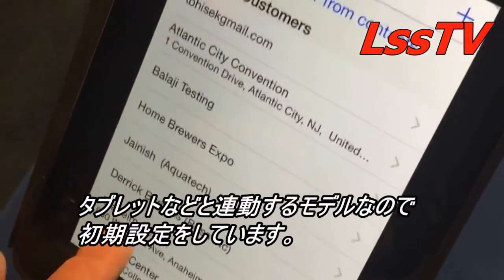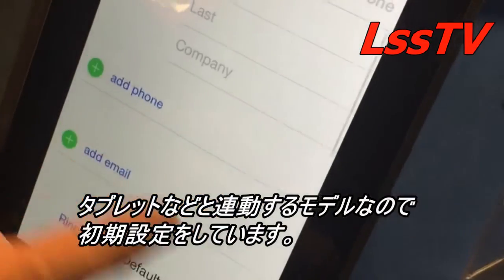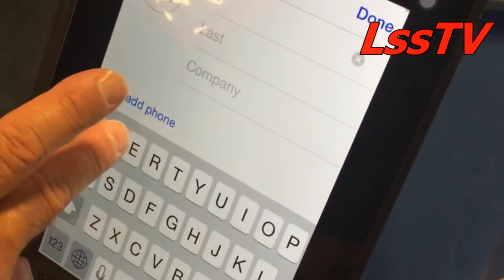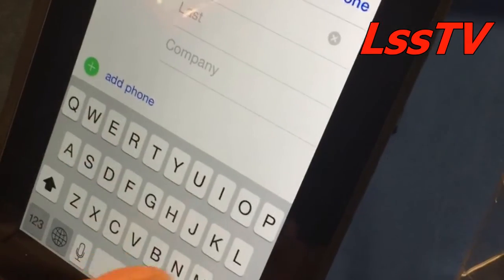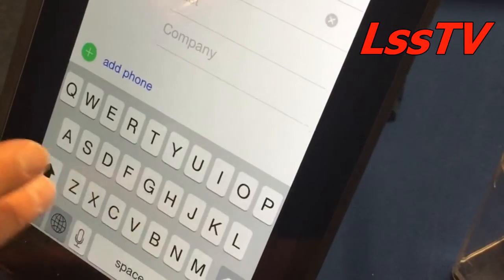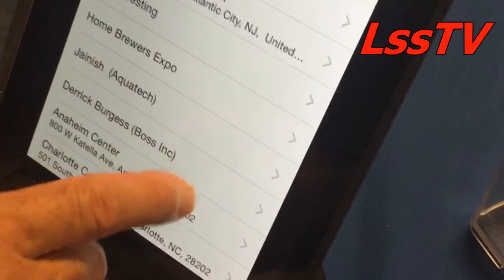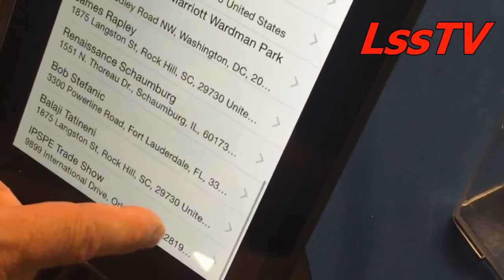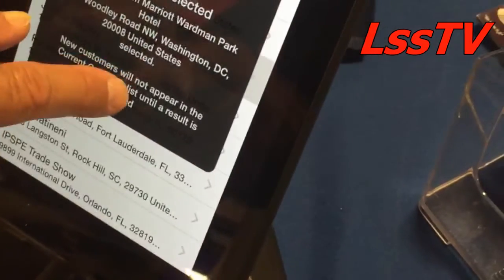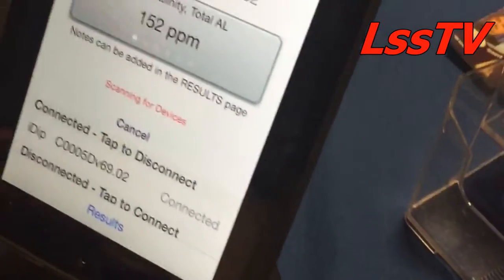I already have a lot of people I've used, but you can also hit plus and then type in a name like 'test location' or anything. I'm not going to fill out test location one, but I could have put a physical address, phone number, all kinds of information. What I'm going to do is Marine Aquarium — we've got the full address at this location — and then we're going to go into Bluetooth test.